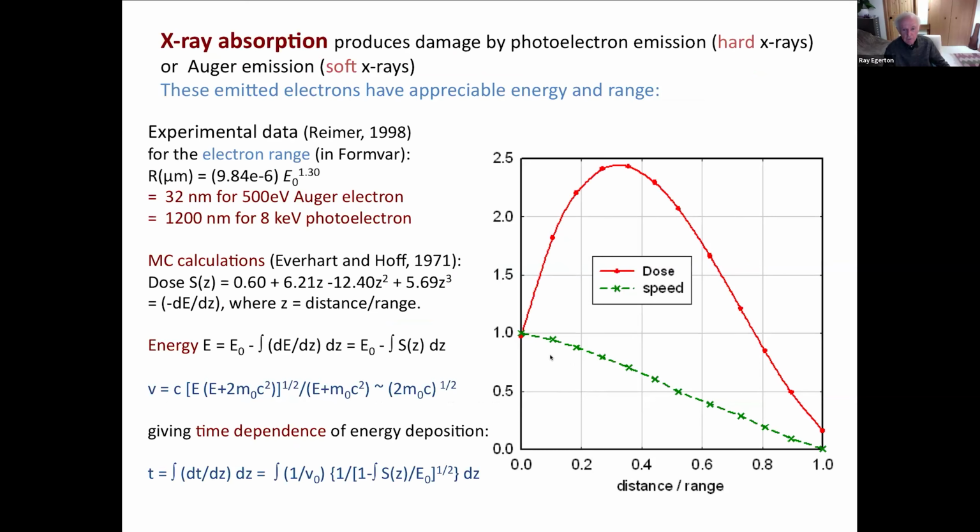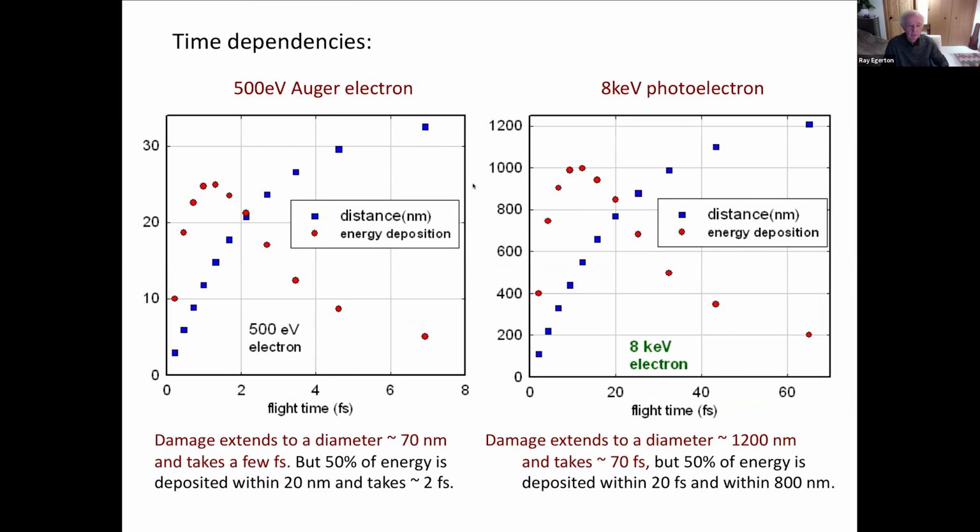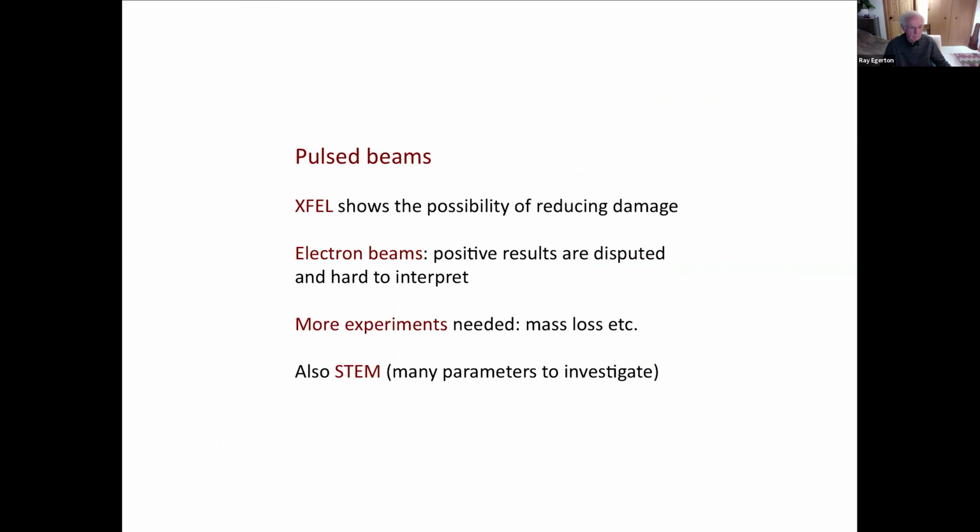And those Auger electrons have an appreciable range because their energy can be hundreds of electron volts. So for X-rays, the initial localization of the damage is on a larger scale, a scale of tens of nanometers or even hundreds of nanometers. And so these differences between electrons and X-rays, I think, might tell us something about the mechanisms of radiolysis for both X-rays and electrons.